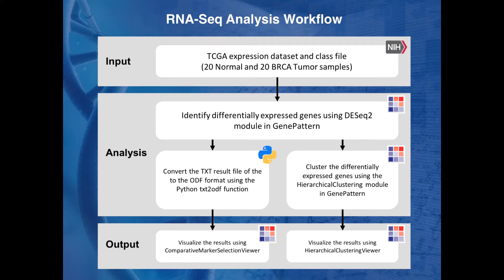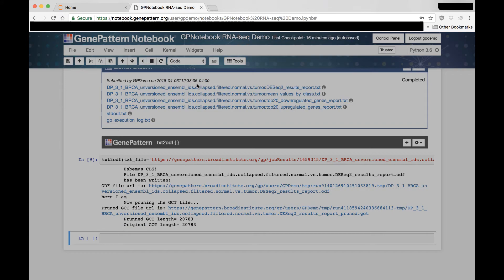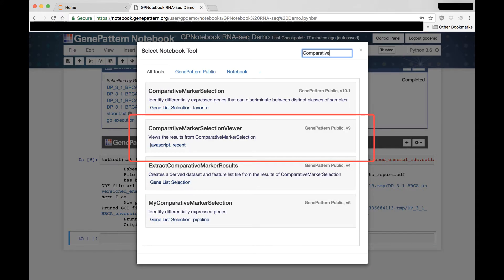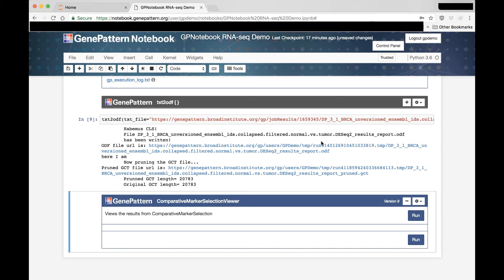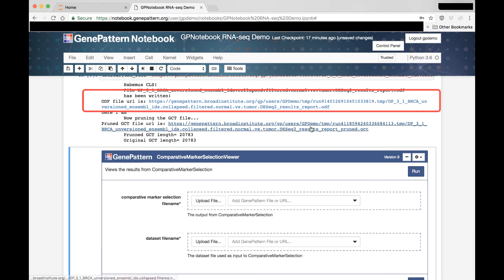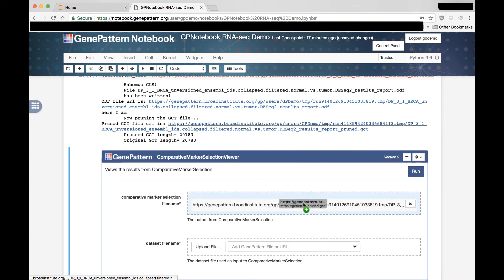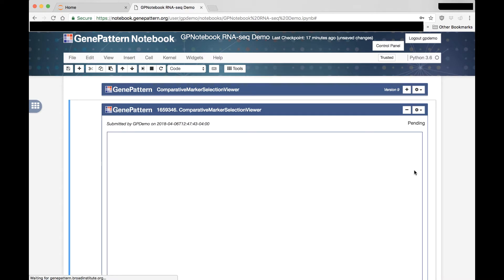The last step in our example differential expression workflow is the visualization of our DESeq2 results, which we just converted from TXT to ODF for use in the GenePattern module, Comparative Marker Selection Viewer. To add this module to our notebook, as before, we create a new cell and change its type to GenePattern. We then search for Comparative Marker Selection Viewer and add that to the notebook. Next, we drag in the ODF file, which was created from our UI Builder Python function, and the GCT file that was produced in that same function. Then we run the module which produces an interactive JavaScript viewer displaying our data in our notebook.